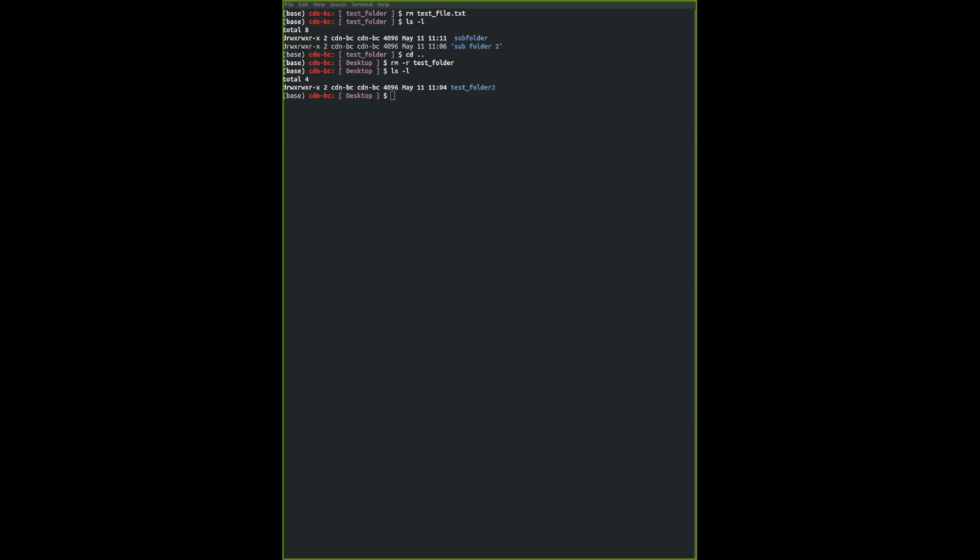So basically, I just want you to go back to your home folder and create several folders there using terminal. And I trust that you do practice and try out creating directories from terminal. There are several folders that you are going to create. I will explain to you what these folders are, but just pay attention that within the folder originals, I want you to create a subfolder called FASTQ, and we will pick up from where we stopped after the break.